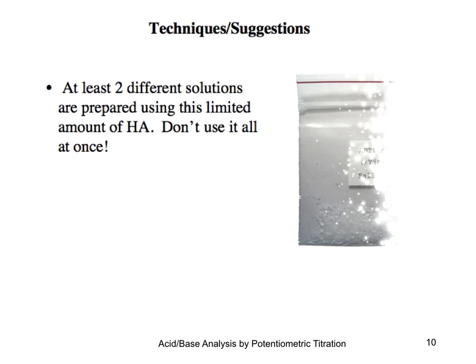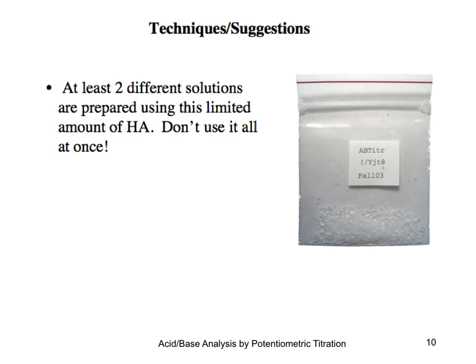Your TA will give you a packet that contains a small amount of your unknown. You will need to make 2 solutions of your unknown, so do not use it all at once. If you run out of unknown, you will have to start the lab over.